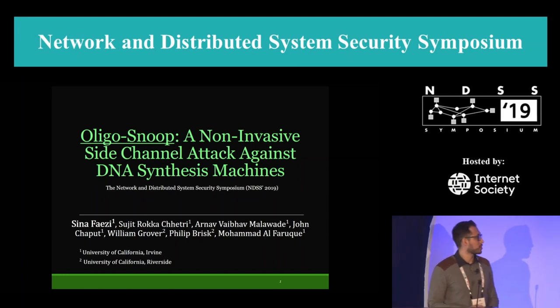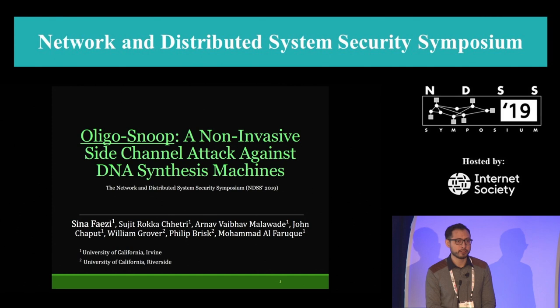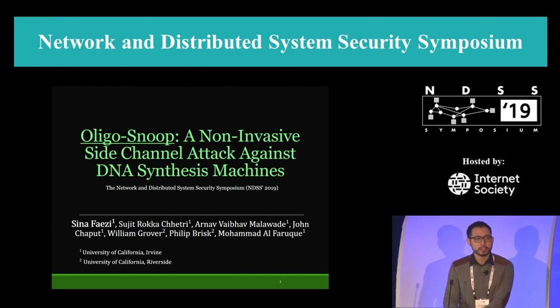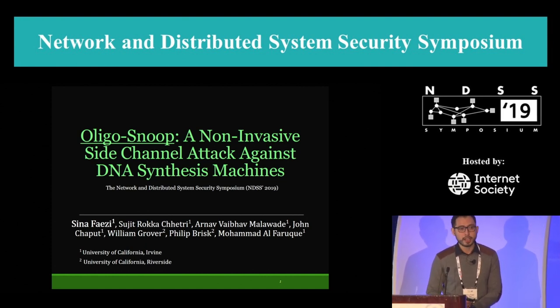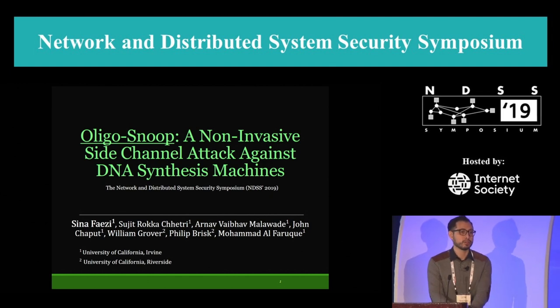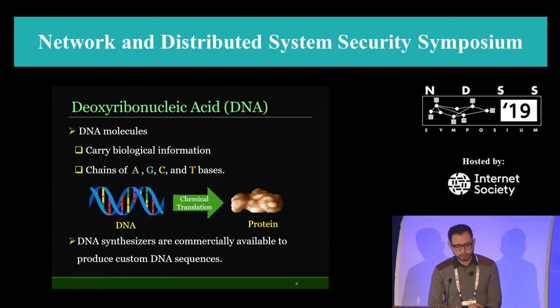Today, I'm going to present to you a new side-channel attack methodology against commercially available DNA synthesizers. This work is a result of a collaboration between multiple departments in UC Irvine and UC Riverside as a part of an effort to produce high-throughput, secured DNA synthesizers.